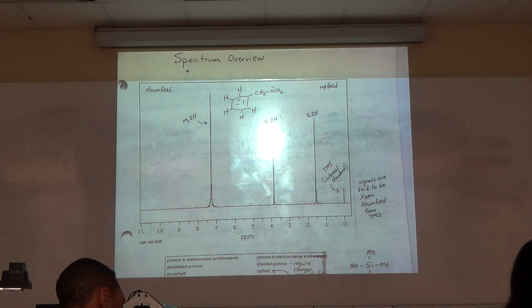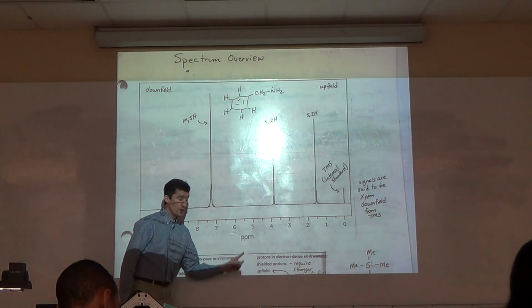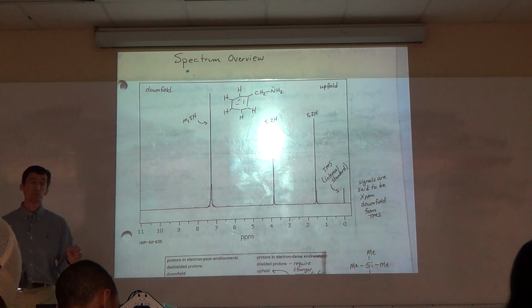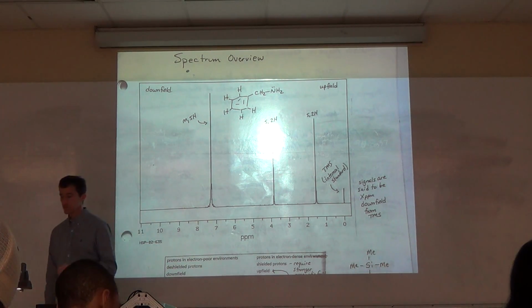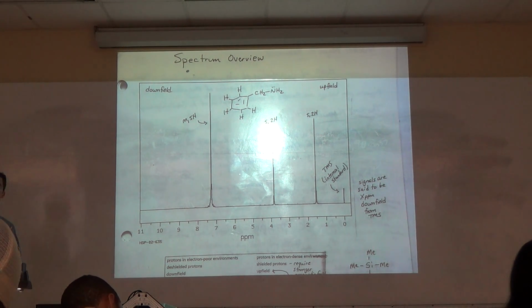In NMR, you don't plot wavelength. You also don't plot frequency. But you are using light. What you plot is ppm. Now, obviously, that's parts per million. So we'll have to eventually define what it really refers to and why it's used, etc. Not going to do that quite yet.